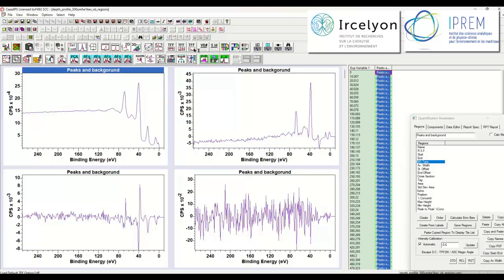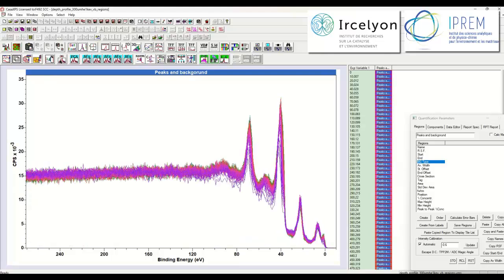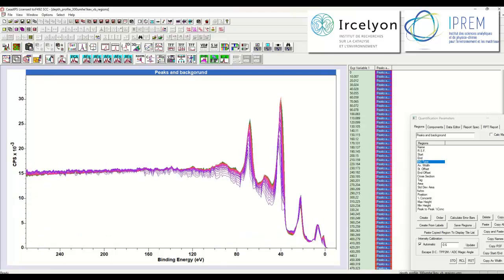So let's go back to the data in a form that we can work on and produce noise reduced spectra by using only 3 abstract factors to reproduce the data. So those first 3 abstract factors were the ones that I've included when I calculate these spectra. Now that would suggest I'm hunting for 3 different shapes, but I'm going to start off by just attempting to calculate 2 shapes that are able to represent most of the variation in the data.